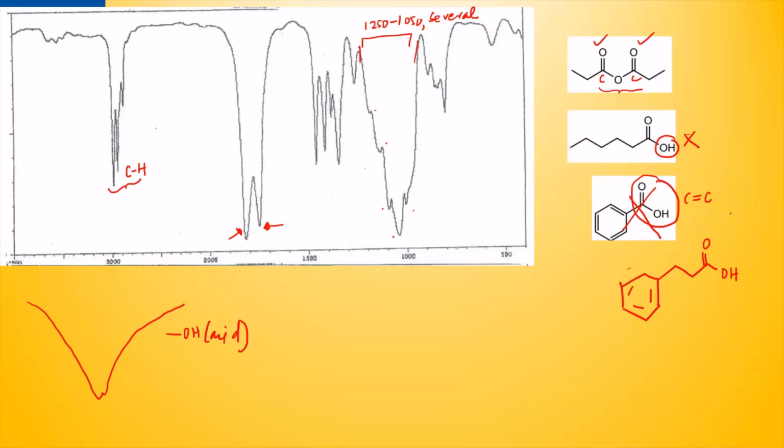So it fails on two counts because the fact you don't see an acid functional group, you could have straight away eliminated this and gone for this. But I went a long way route just to justify the fact I gave this molecule in the first place. So our answer is, again, it took a lot less time. If I had just gone for a quiz-like thing, what is the answer? I would have done it in 30 seconds or less. But you see the point of how I'm going about approaching this: I'm using the table.